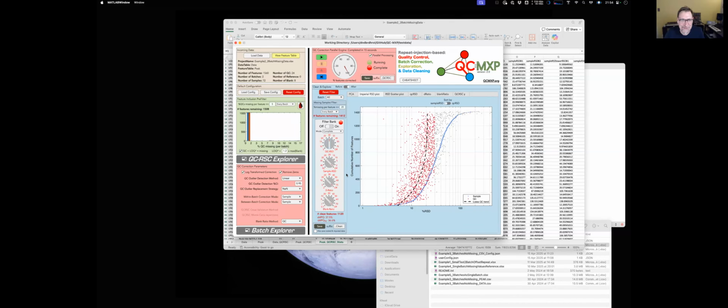Again, in version 1, I was giving everybody the option to do everything they like. And as we discussed over email, sometimes too much information is not helpful. And I've never used it in the other mode. It really is, simply put, if you don't do a log transformation, then the correction needs to be divided. If you do a log transformation, then you subtract, and it's just a simple case of log maths. So that's the only reason it was changed.